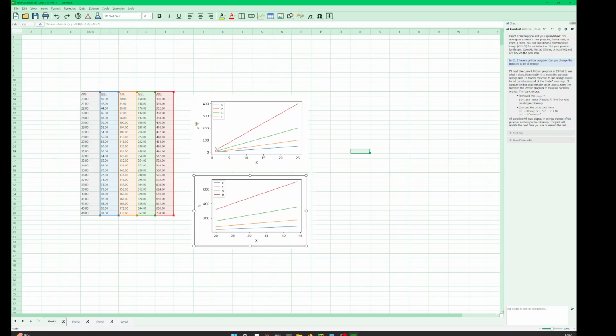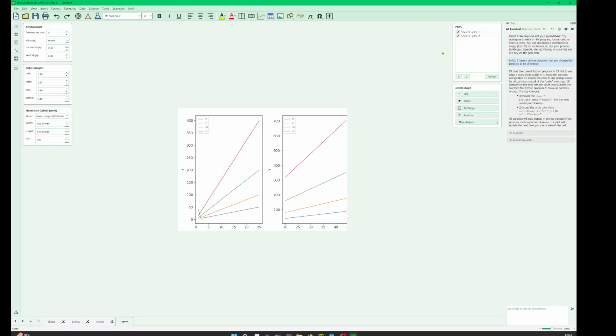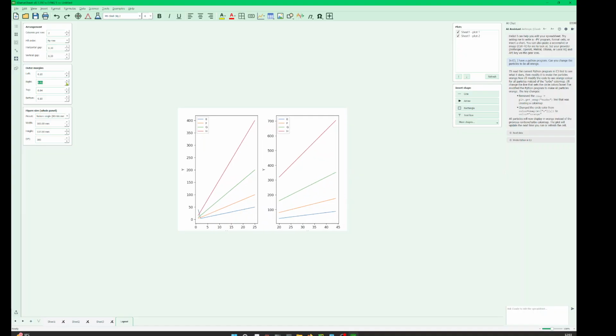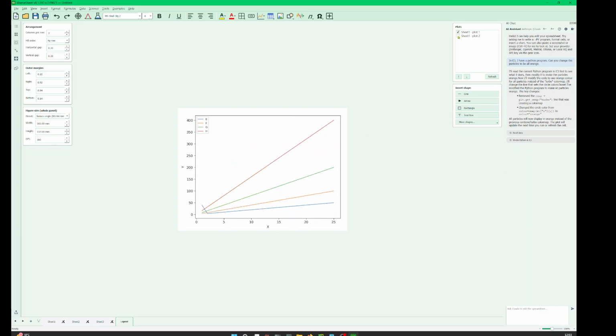So another thing that I have added, which I think is also useful, is a layout. So now a layout would have the plot that we've just created and actually all the plots that we create. So in here, we could deselect and you just get one here. Currently, it's just this one. Let me just change the right so that it looks at least inside, and maybe this also inside. And so now when you do it, it just looks inside.